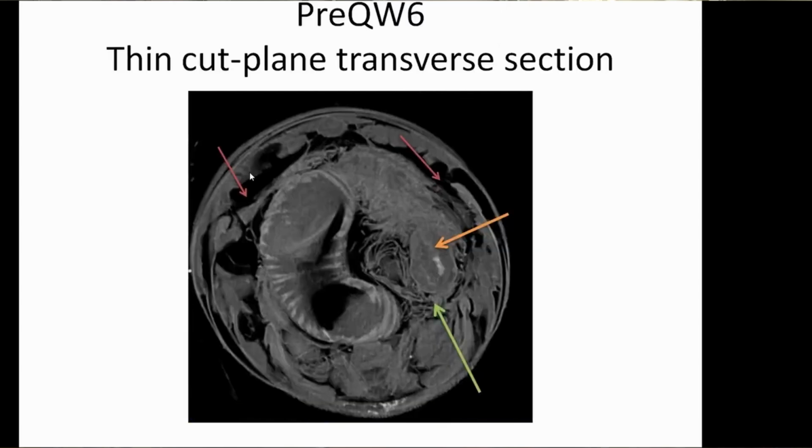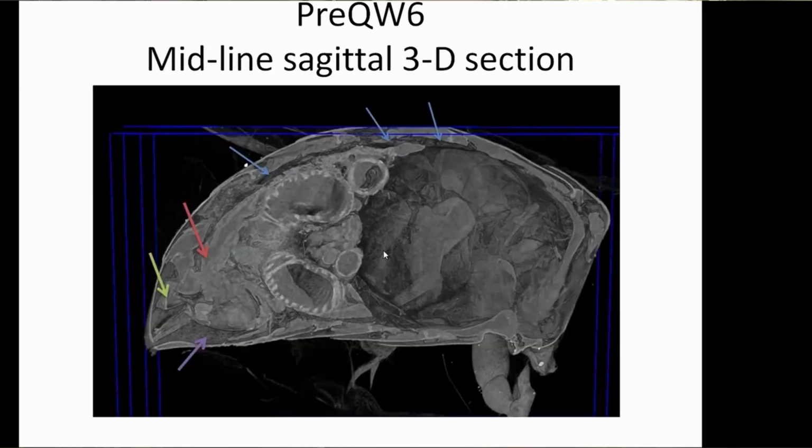This we've done a double cut to see it rather better, and I think this is perhaps the best view of all of the Malpighian tubules. So again, there's the dorsal heart and the abdominal aorta and all the other mayhem we've talked about.